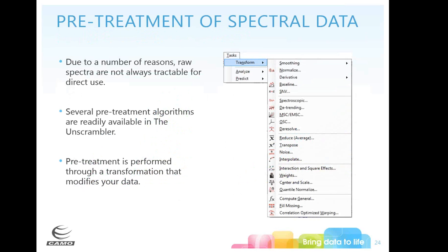In the Unscrambler, we have lots of types of pretreatments. The top box with smoothing, normalize, and baseline are used most often. The next box has more complex spectroscopic pretreatments. If you are collecting in transmission mode, you can convert to absorbance mode — same with reflectance — and there is an ATR correction under the spectroscopic options as well.